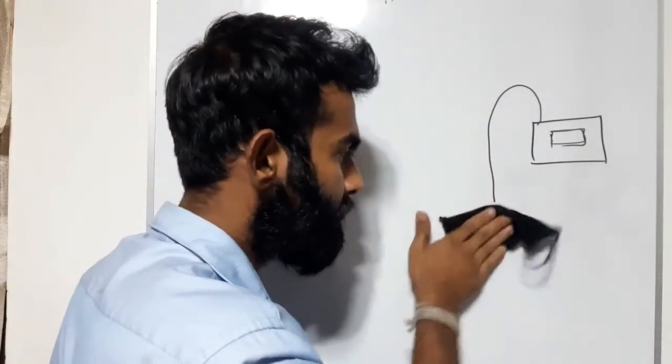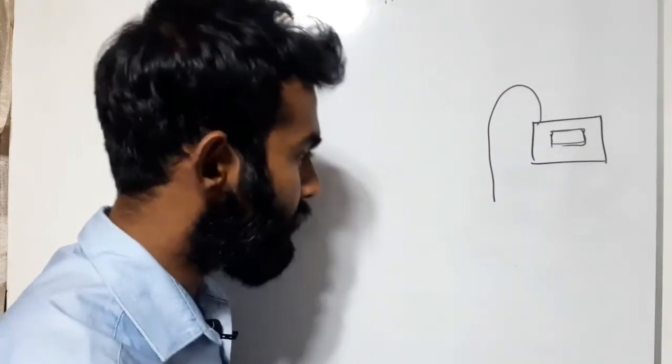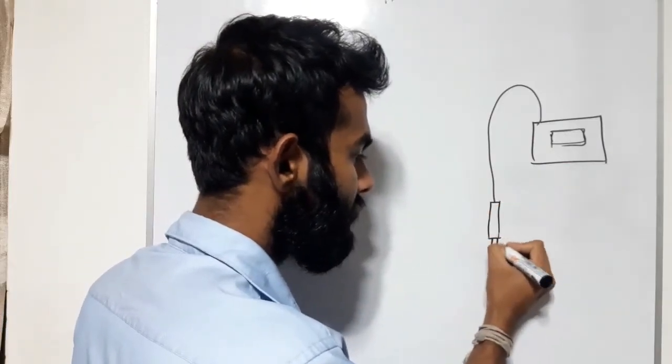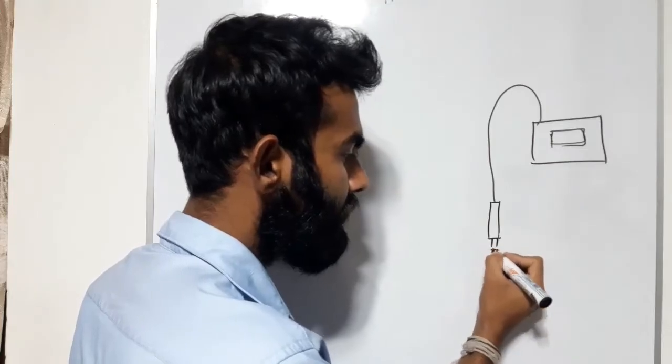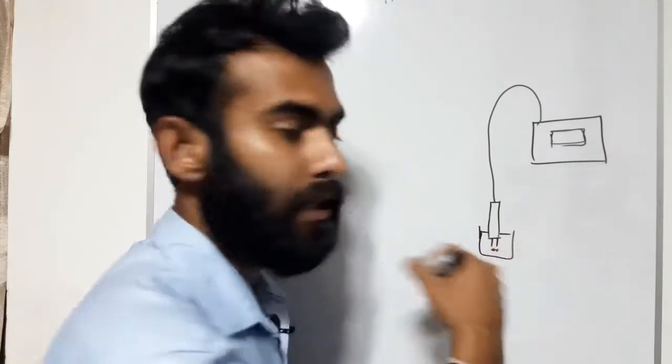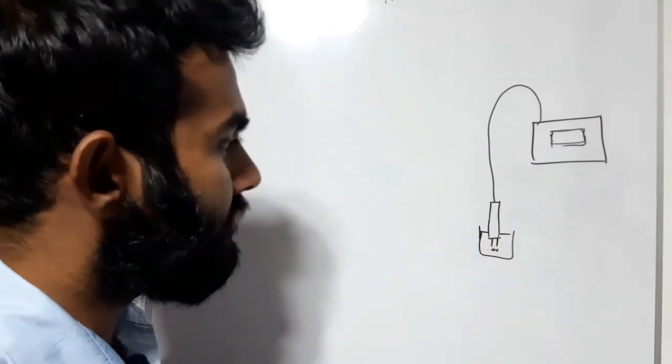It's the electrode. Two metal plates are there. We will measure the conductance between these two metals, so we have to fully immerse them in a particular solution. So that's the first thing you have to remember.